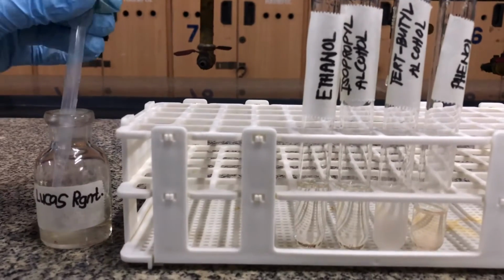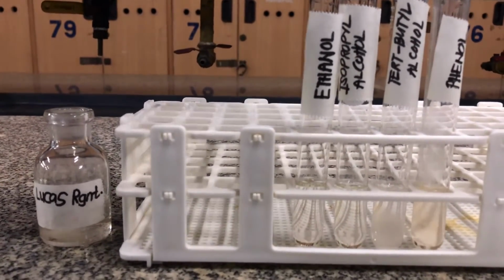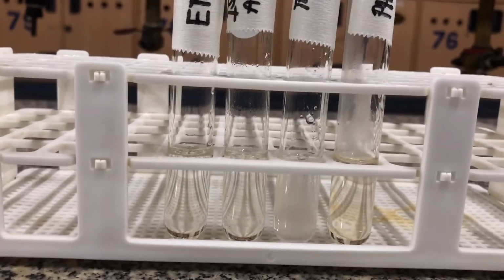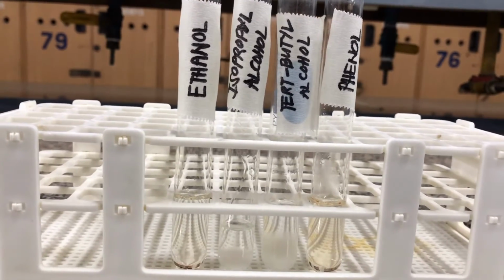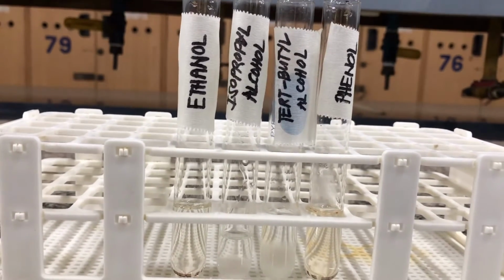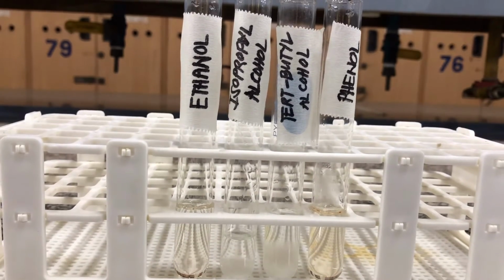Notice how the tert-butyl alcohol reacts immediately upon the addition of the Lucas reagent, as evidenced by the formation of a cloudy layer. After standing the test tubes for 5 minutes, isopropyl alcohol showed the same result, while ethanol and phenol showed no appreciable reaction.